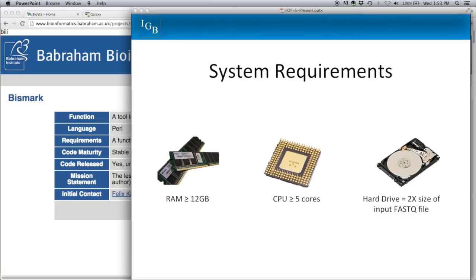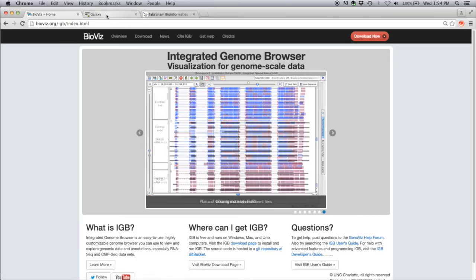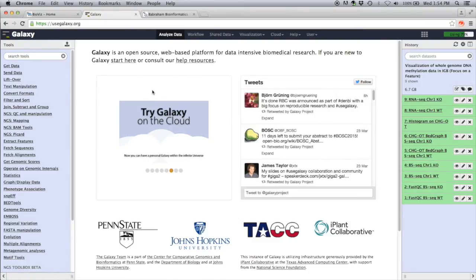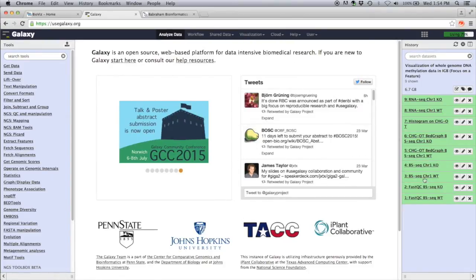Today's example comes from a Cell paper looking at methylation in Arabidopsis, where authors were interested in the effect of knocking out genome methylation, comparing wild type to a knockout. I've included all the data in a public Galaxy instance. Also make sure you have IGB running in the background — you can get it at bioviz.org under downloads. In Galaxy, on the left are your tools, in the center is the main page, and on the right is your history, which is what we'll primarily be working with today.